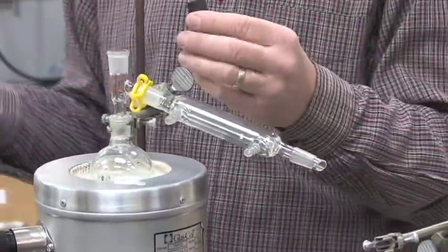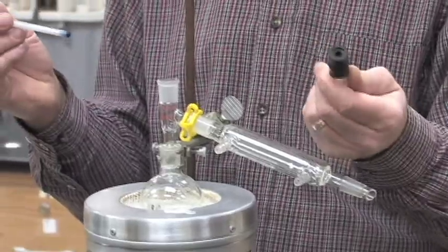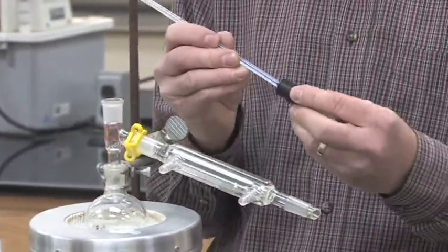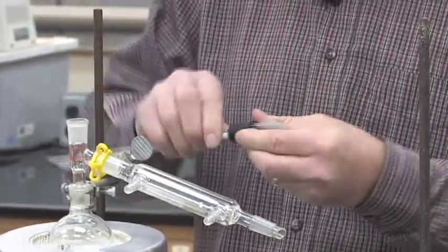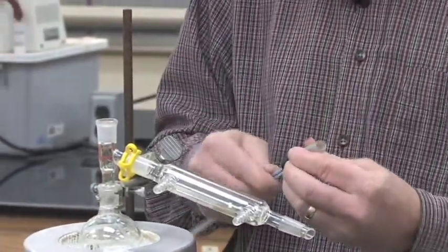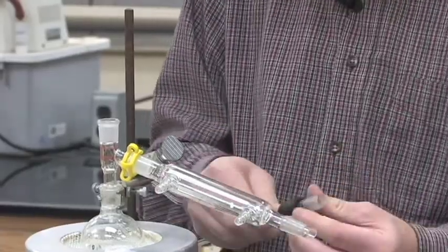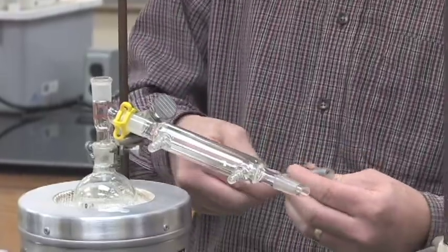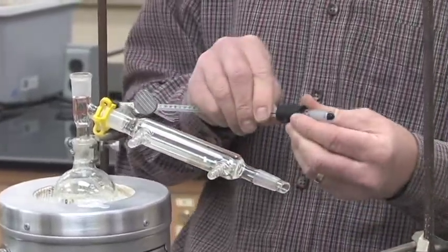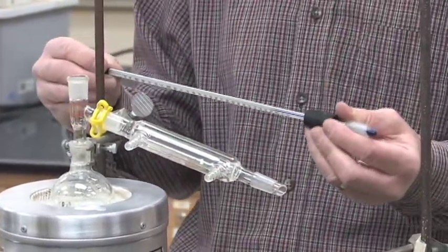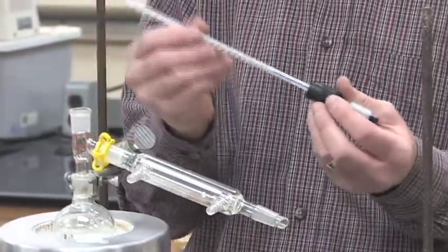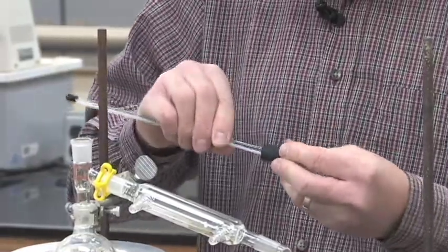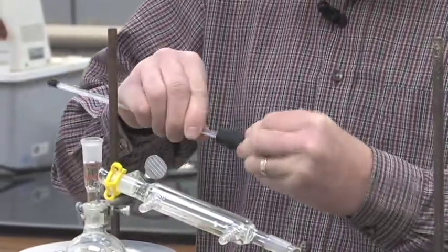We need to have our thermometer adapter and we need to put our thermometer in there. When we do that, we need to be very careful about sliding the thermometer in and when you add it in, slowly twist it and hold it close to the top of the thermometer adapter so that you don't put any force on the thermometer and end up breaking the thermometer. If you break the thermometer as you're pushing it in, it will end up sending the thermometer through the palm of your hand and we don't want to have that happen in the organic lab.